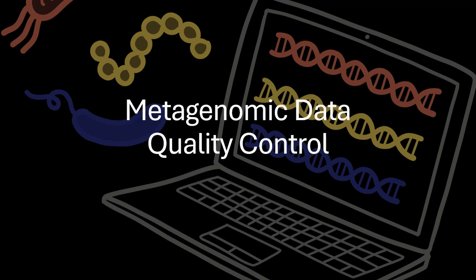Hey all, in this video we are going to talk about metagenomic data quality control tools.